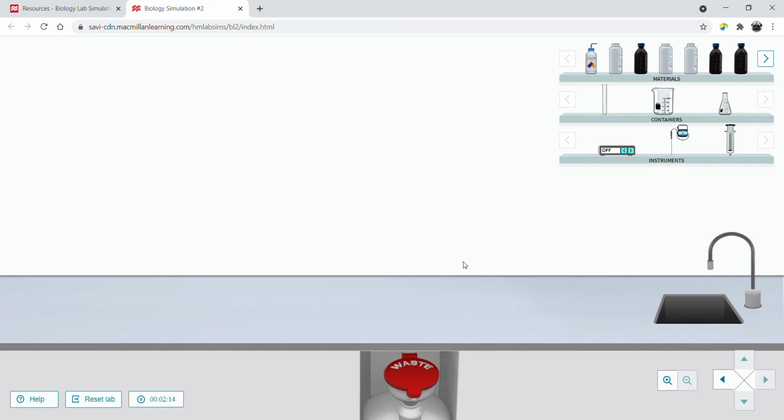As always, please read through this material before you get started, just to give you the background of the information. The sheet that is uploaded to your lab folder is what you fill out, and then submit for your lab. So we'll just go ahead and get started. This lab's a little bit longer. We do this wet lab pretty much exactly how you see it in the on-campus version of the lab. It takes a while too, but no worries. It's all good.